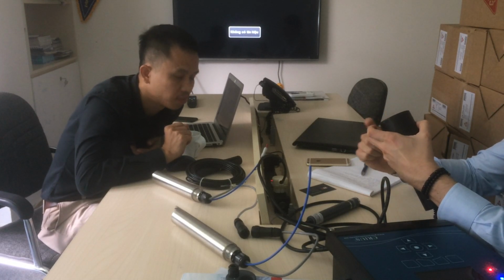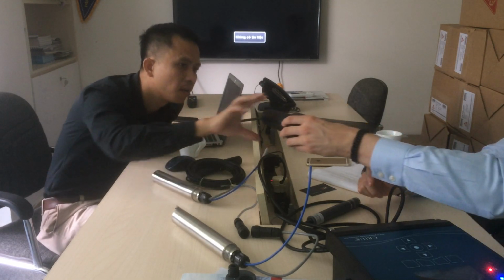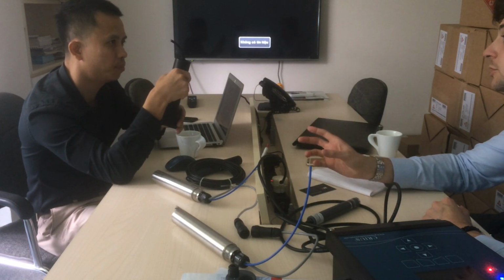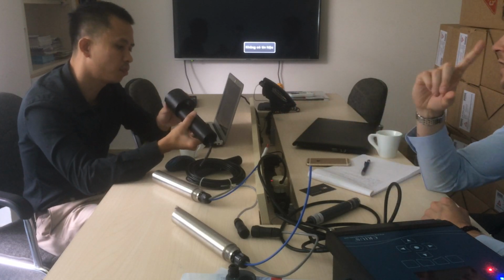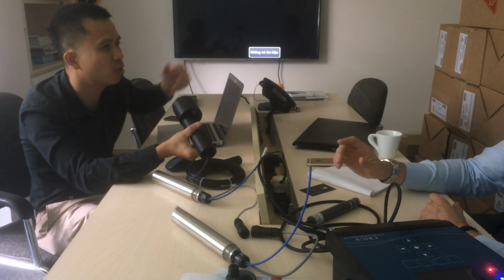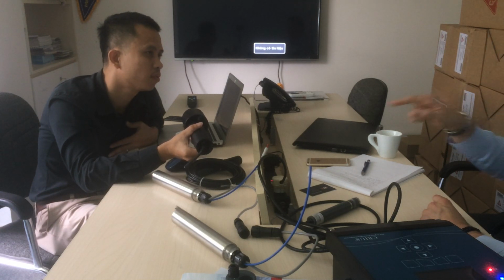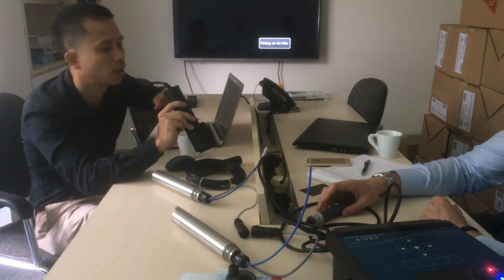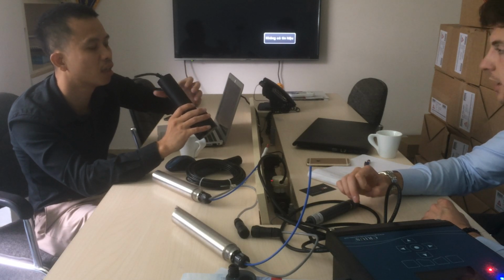And again, you can use air or water, but we suggest using air. Put the air or water here. We suggest air because an advantage of this sensor is that it has self-checking. Because the air contains oxygen, when you blast it across there, it checks for a response. If it has a response, it knows that the sensor is still working. So it's a clever feature. See the plastic?